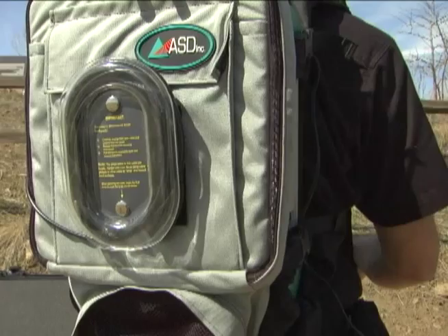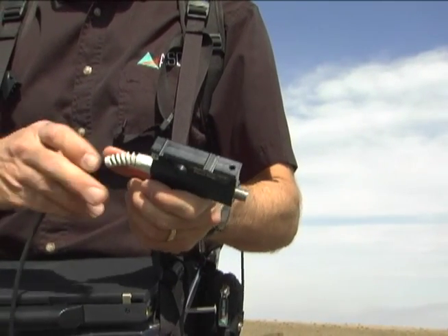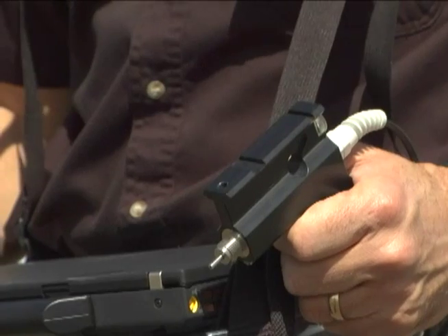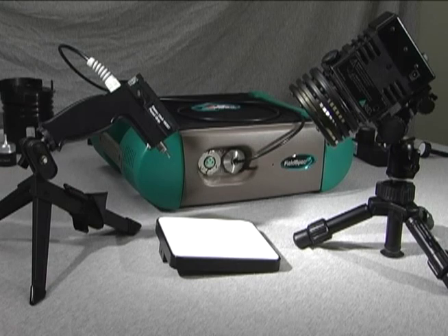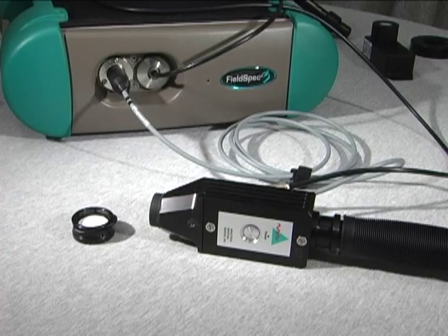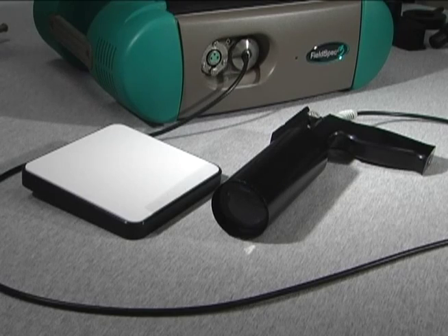You can basically put an instrument in a backpack, run a fiber optic around the front, and really the tip of the instrument is where all the activity is. The field of view of the bare fiber optic cable is 25 degrees. We also offer several view-limiting fore-optics that can be placed over the end of the fiber optic cable to allow you to narrow the field of view down to as little as one degree.